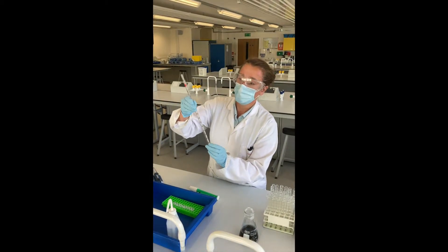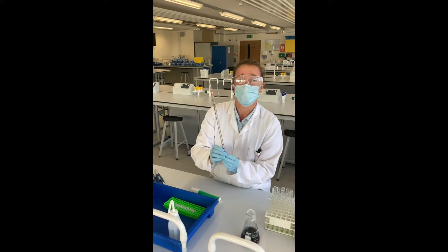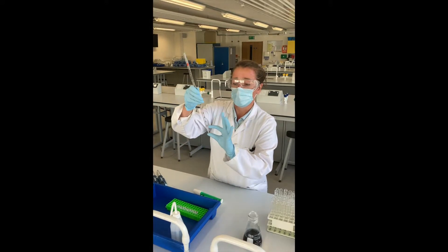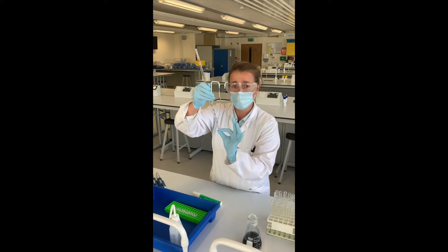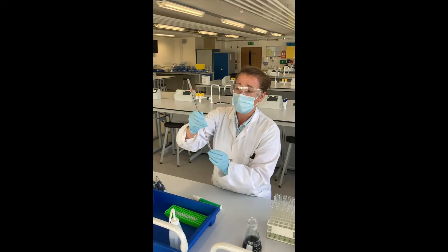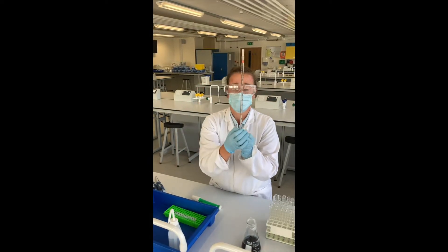Always double check to make sure that the scale will fully cover the 5ml. Because in some pipettes the reservoir — the bottom section — will need to be included in that 5ml. In others, you need to keep that reservoir full and only dispense from the top line down to the bottom line.